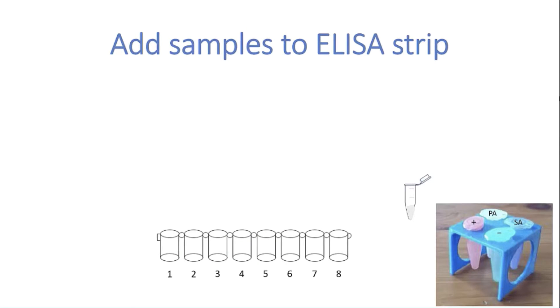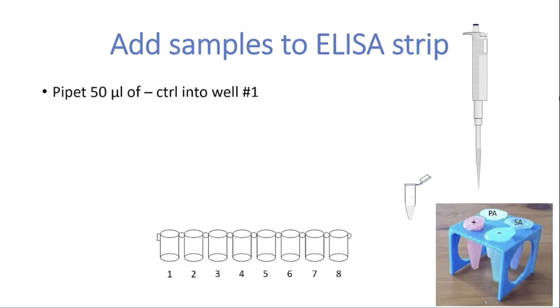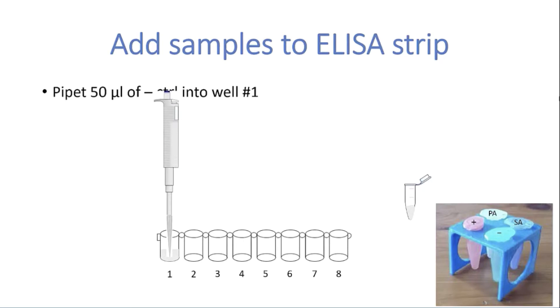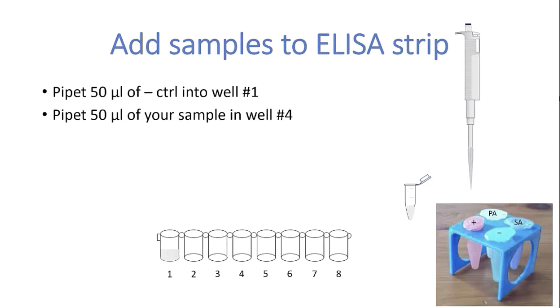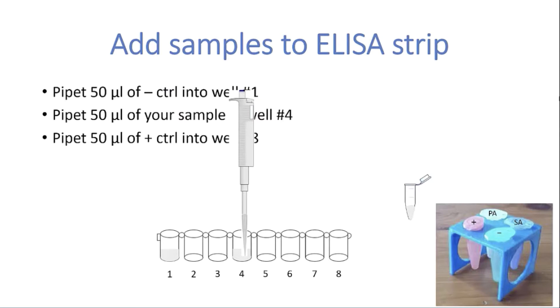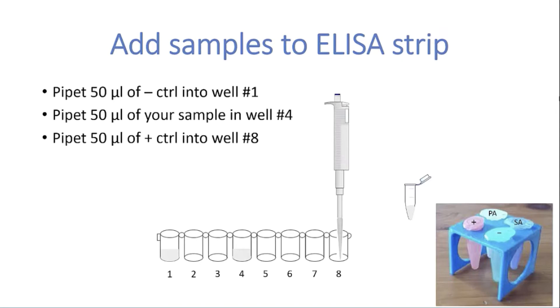Everybody will receive an ELISA strip to complete their analysis. Samples are added to the ELISA strip: 50 µL of the negative control is pipetted into well number 1, then 50 µL of the sample is pipetted into well number 4, and finally 50 µL of the positive control is pipetted into well number 8. The strip is allowed to sit for 5 minutes for binding to complete.